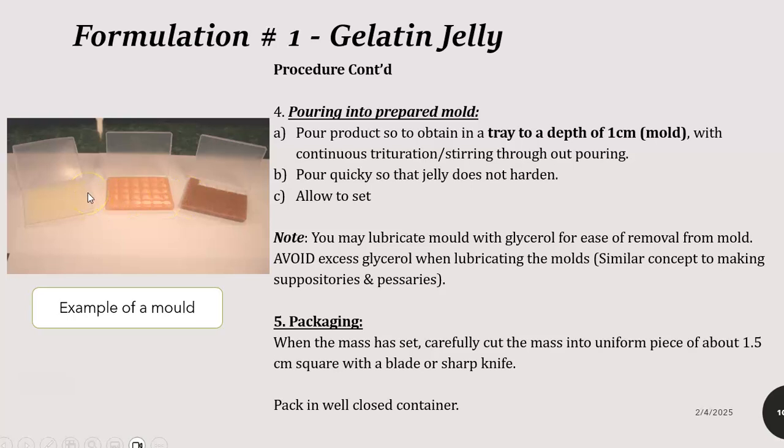Unfortunately, we don't have these, but we're going to use the 55cc pill jars, nice cover, about a quarter-inch depth, which is very nice for demonstrating this principle. So you're going to retrieve some 55cc jar pill covers, and we're going to use that as our mold. You could lubricate it with a little touch of glycerin so that the product ejects very easily.